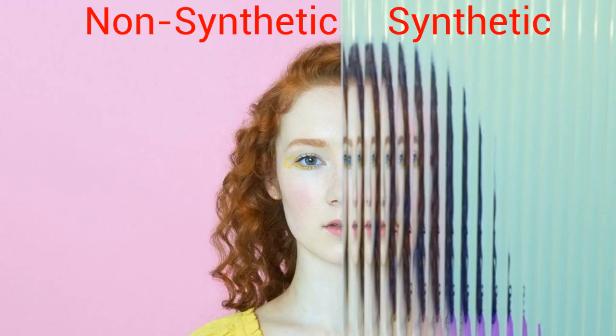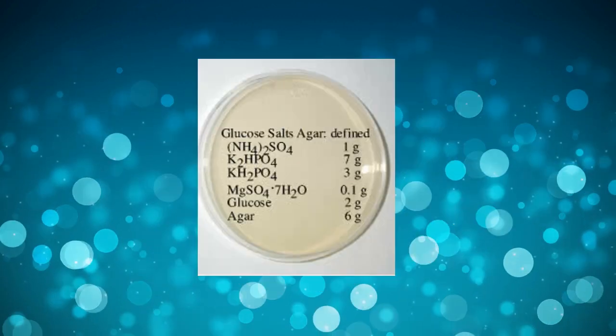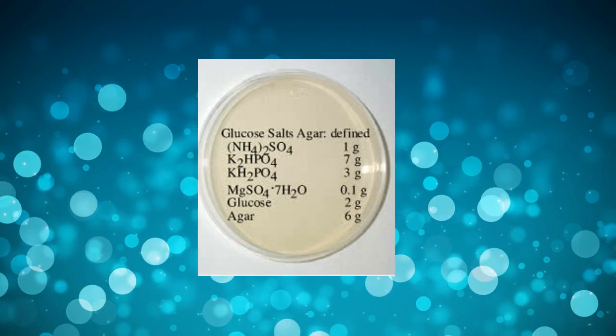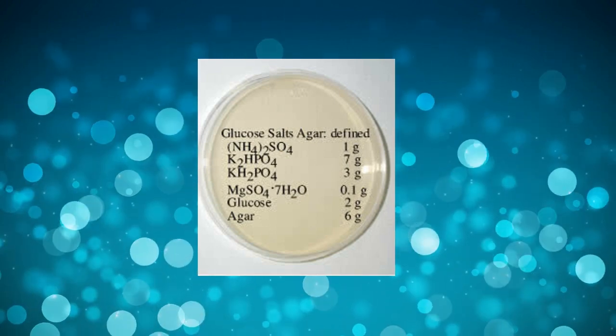Based on their chemical composition, the media are divided into synthetic or non-synthetic. Synthetic media or defined media are standardized and are reproducible. They contain pure organic and inorganic compounds in specific molecular content with an exact formula.